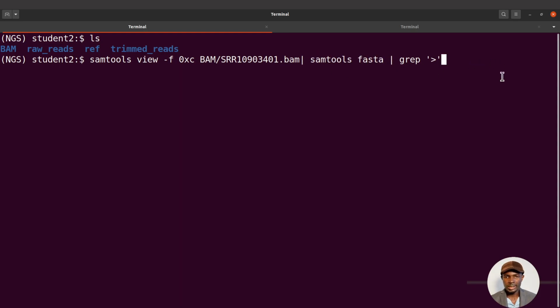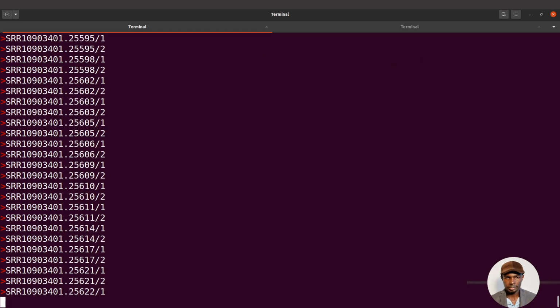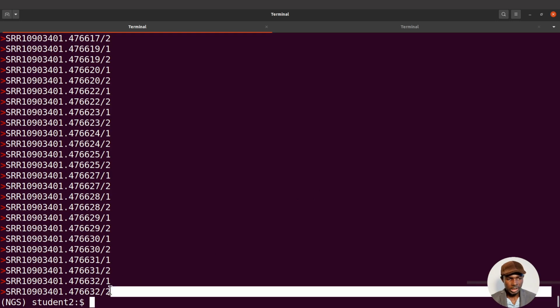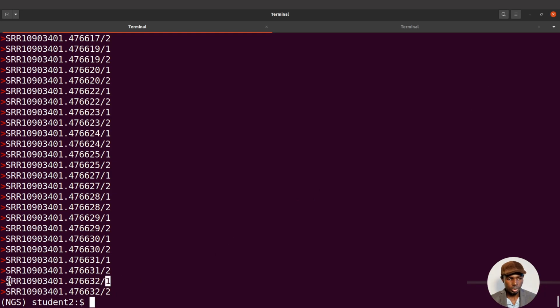So let's execute this command. We are going to have something like this. But still, we see 1 and 2. That is for read 1 and read 2. And we also see this. We don't want it. Technically, you can still maintain this. It's fine. But we will just streamline things here.